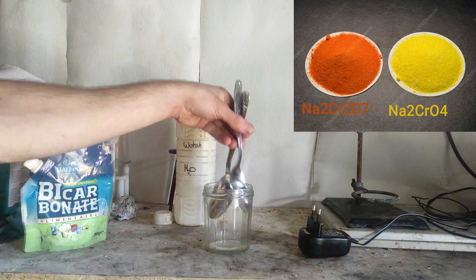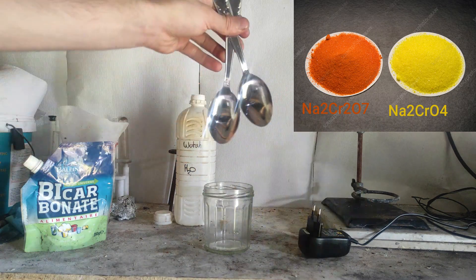Hello everyone. Today we're making chromates and dichromates from stainless steel by the electrolysis process.